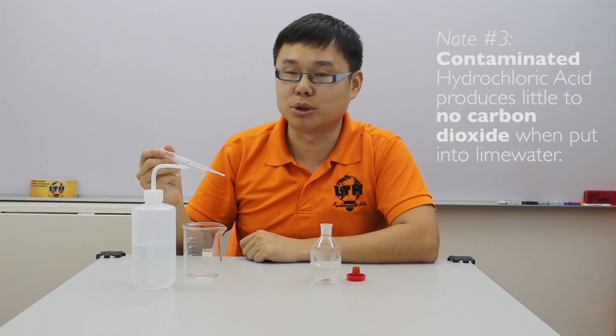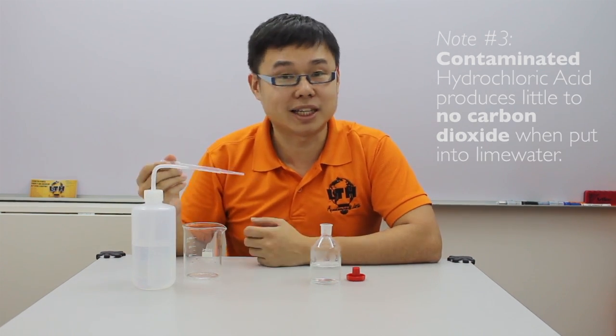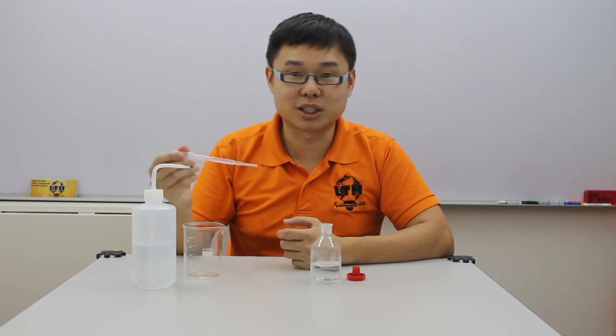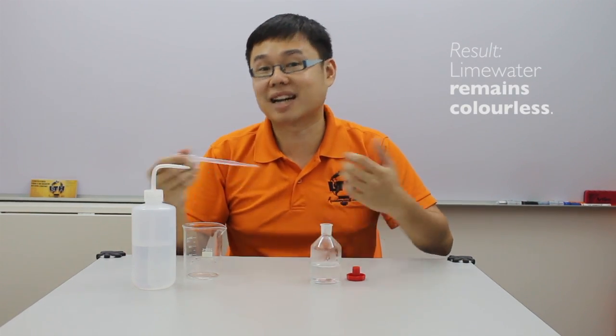That's why the contaminated acid, when used for the reaction, produces very little carbon dioxide or no carbon dioxide at all. And that's why no matter how long you use it to test for carbon dioxide in lime water, the lime water remains colorless.